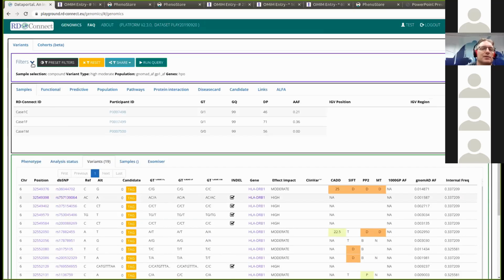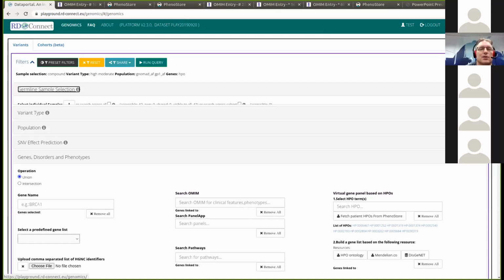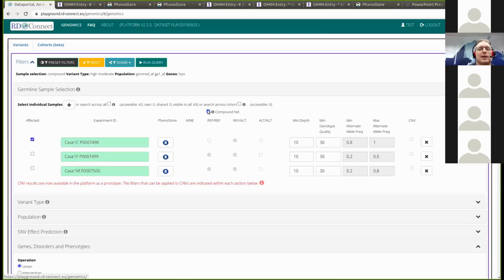So this is the first time this has been seen in this family. So this might be one of these relatively rare cases, but relatively common in rare diseases, where the individual, the case, actually has a de novo mutation in a gene. So the father and the mother have a reference-like position, but the child has an actual mutation that results in it being heterozygous, and this one heterozygote is enough because it's a de novo autosomal dominant cause of disease. So again, let's run the query.